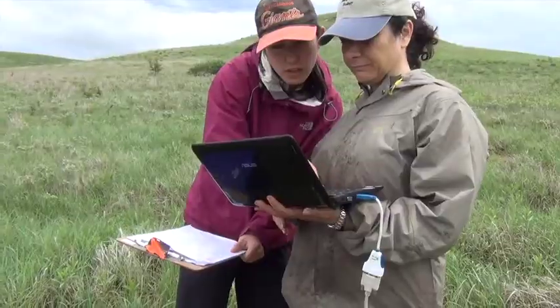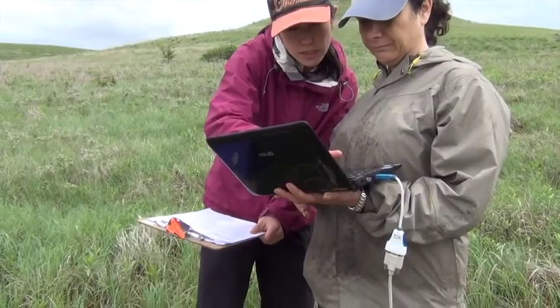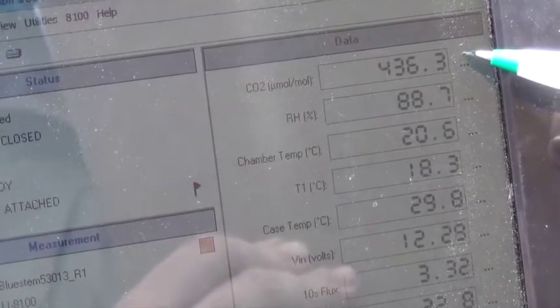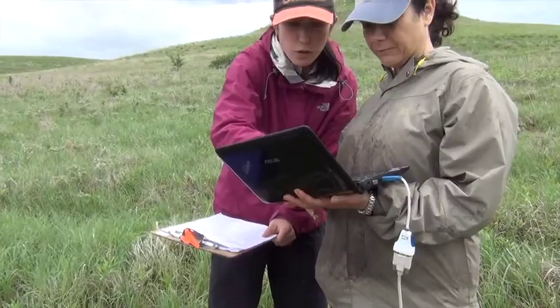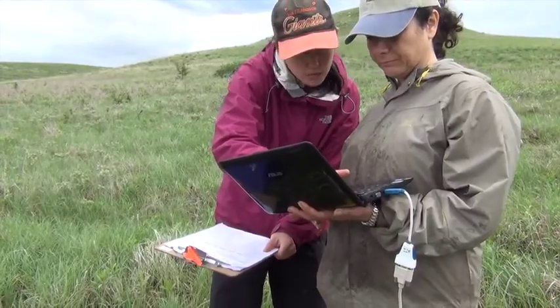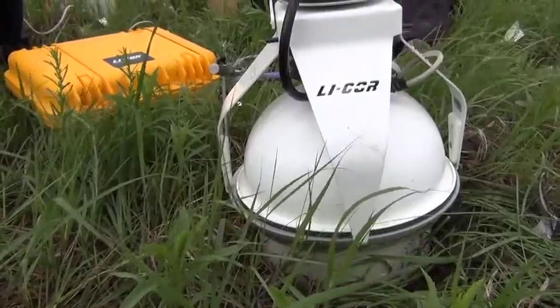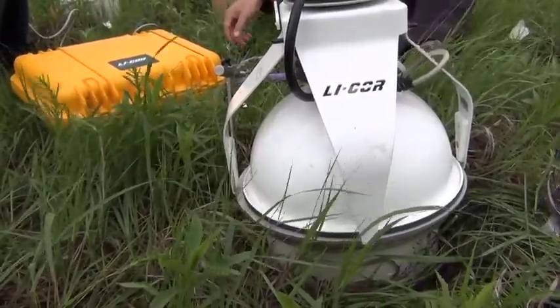While the IRGA is measuring, we can look at the data in real time. The instrument provides a readout of CO2 concentration, as well as other factors like temperature and humidity that help explain what we are seeing. Once the measurement is done, the chamber will open and we'll move on to the next collar.